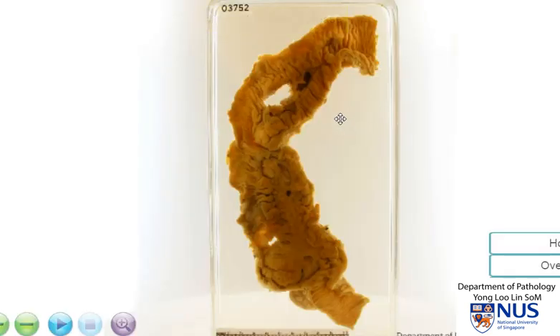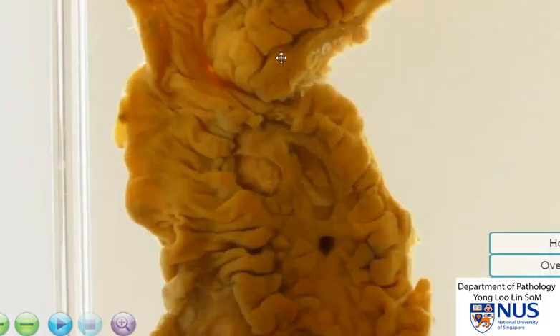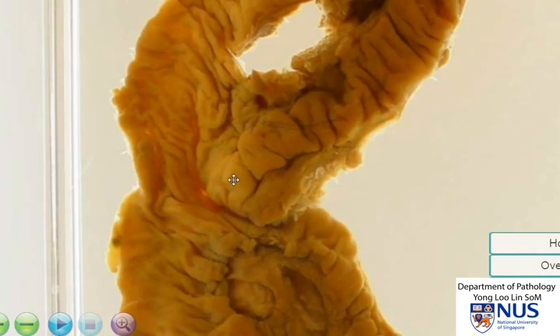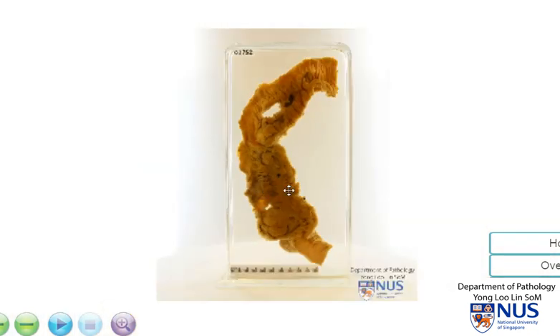To summarize, this is an example of the ileocecal region with the terminal ileum, the cecum, and the ascending colon. The ascending colon is involved by a patchy process with some normal mucosa in between. What we see are ulcers and a cobblestone appearance in some areas of the mucosa, and this is an example of Crohn's disease.